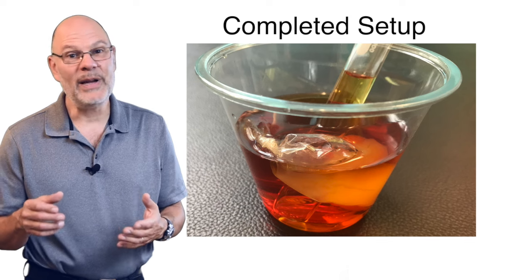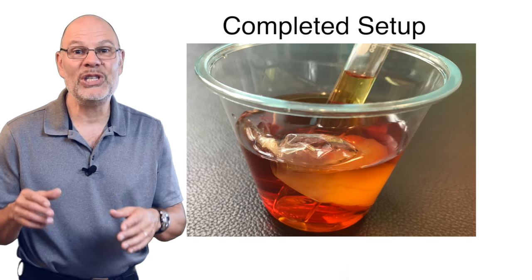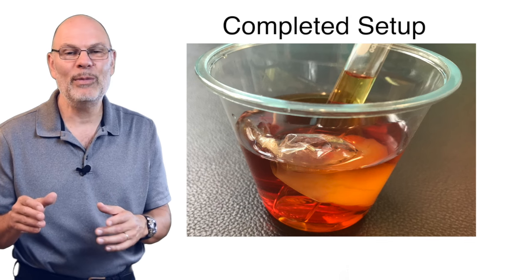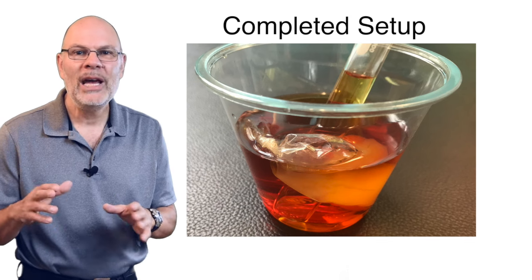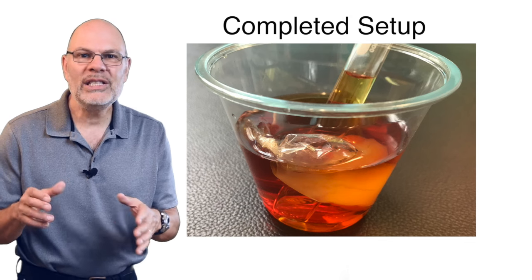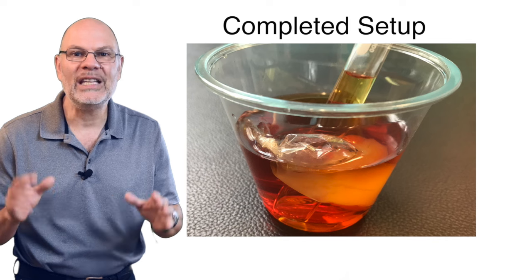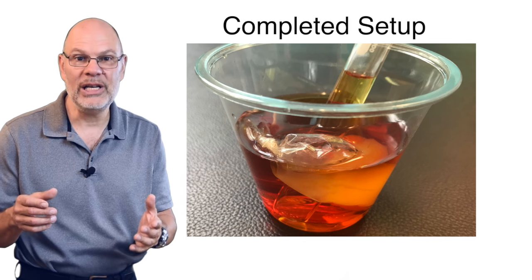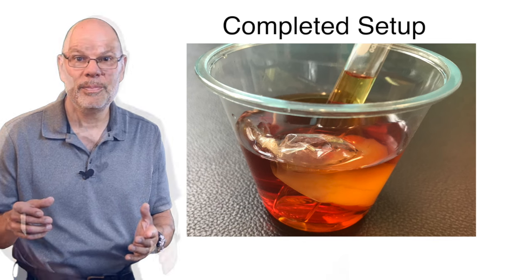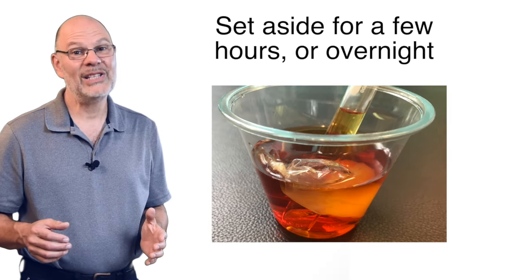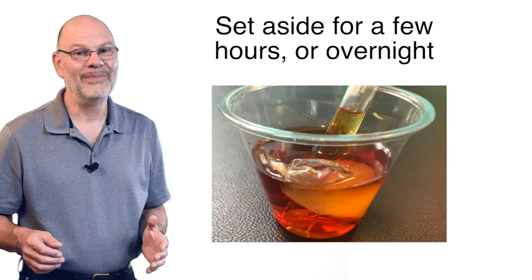The test tube is made of glass, which is an impermeable barrier. In other words, this test tube is allowing us to preserve the initial contents of the solution in the cup. And then I'm going to set it aside.